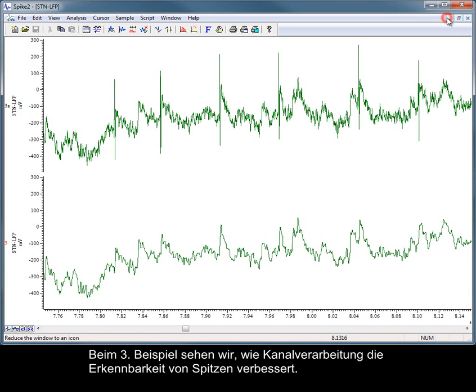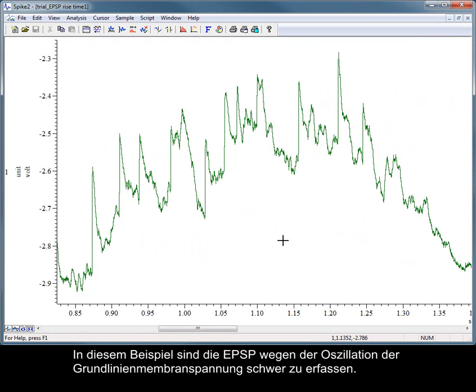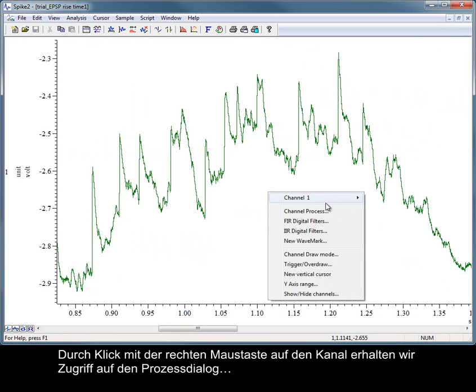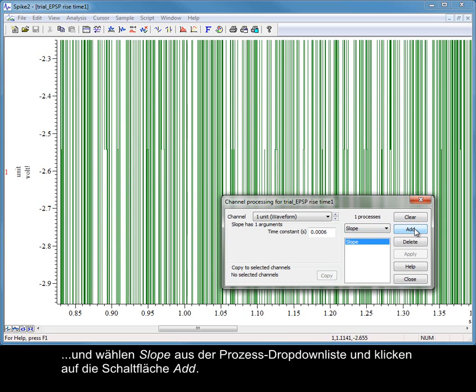Our third example will look at how channel processing can improve detectability of peaks. In this example, the EPSPs are difficult to detect because of the oscillation of the baseline membrane voltage. Let's access the Channel Process dialog by right-clicking on the channel and select Slope from the drop-down process list and click the Add button.